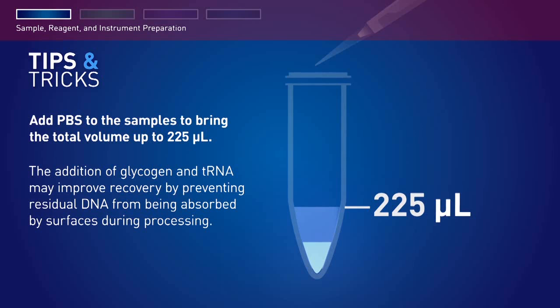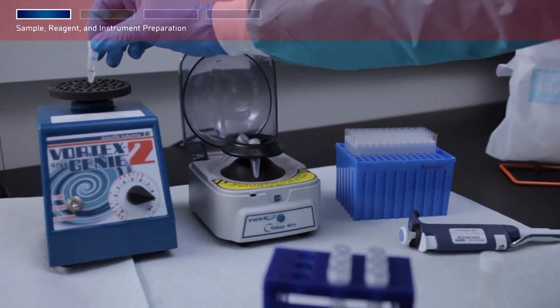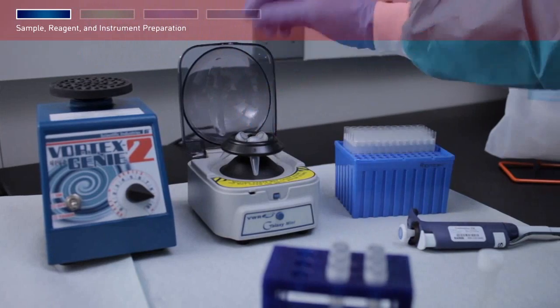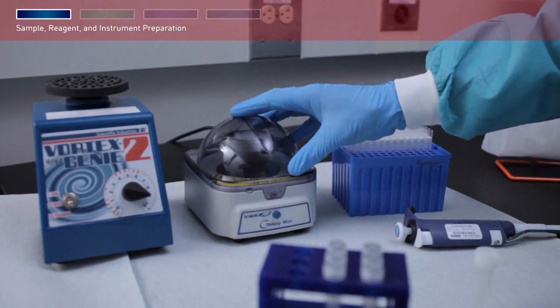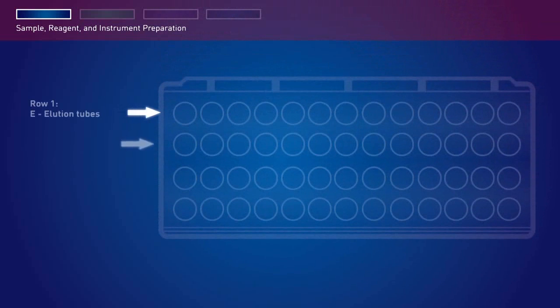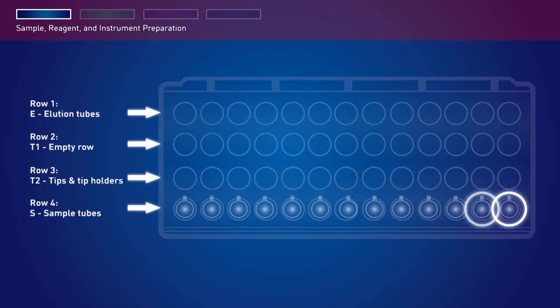In samples expected to have very low levels of DNA, the addition of glycogen and tRNA may improve recovery by preventing residual DNA from being absorbed by surfaces during processing. Cap the tubes and vortex, then briefly spin to collect the samples to the bottom of the sample tube. Remove the screw caps and load the sample tubes into row S, the fourth row of the tip and tube rack.